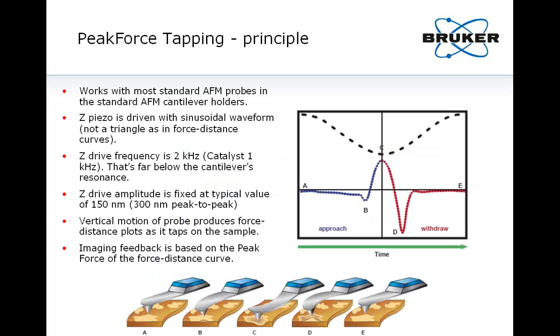So now I would like to acquaint you with a new technique, which some of you might be familiar with, called PeakForce Tapping. It has little to do with tapping mode and can be understood as a kind of combination of tapping mode and force spectroscopy, in the sense that the probe is oscillated but far below its resonance frequency. So it's no more 100 kilohertz or even 10 kilohertz, but 1 or 2 kilohertz depending on the AFM tool. And the force curve is generated and captured each time the tip taps on the surface.